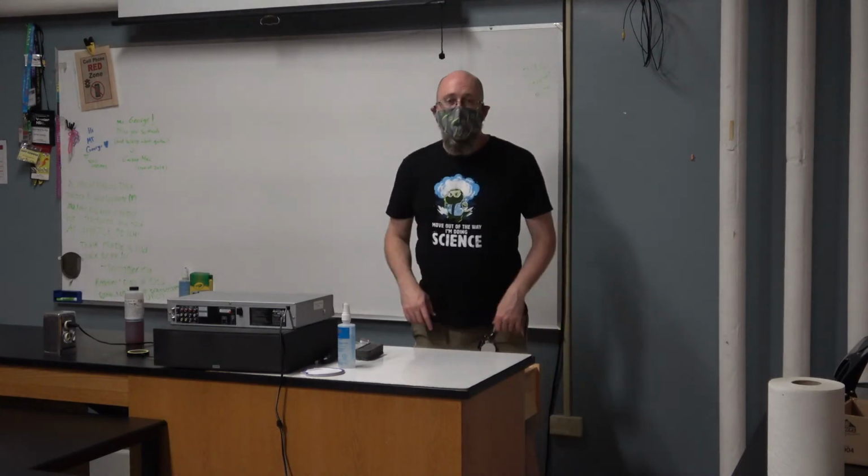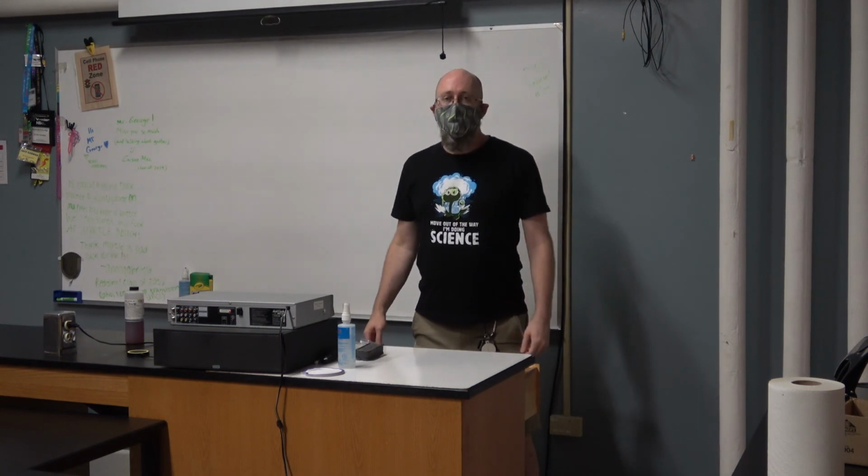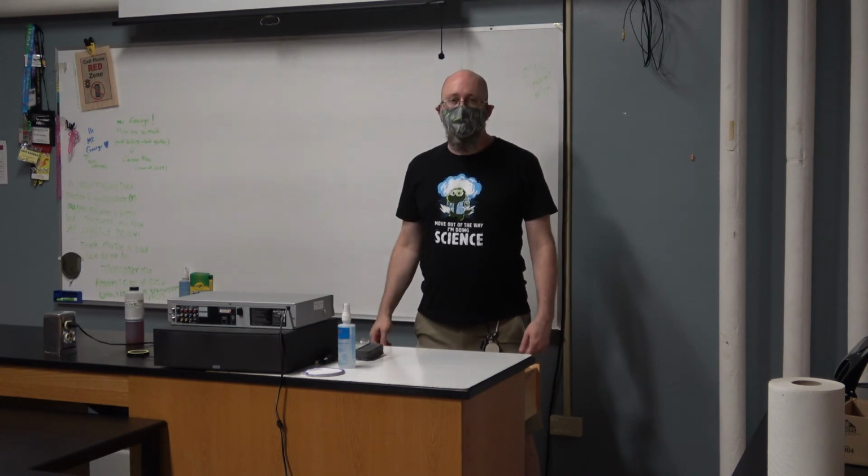One more thing, now that we've done parts 1 and 2, it's time for me to wash my hands. Just want to remind you, you always wash your hands when you're leaving the lab. And washing your hands is not the same thing as sanitizing your hands. Washing is greater than sanitizing. Washing your hands takes care of germs and also other chemicals that might be on your hands. Sanitizing might kill the germs, but doesn't remove other things that might be there.